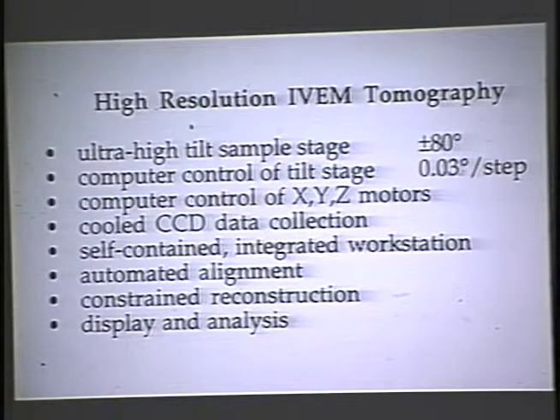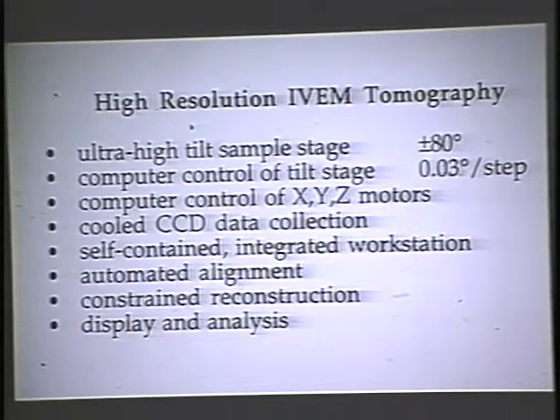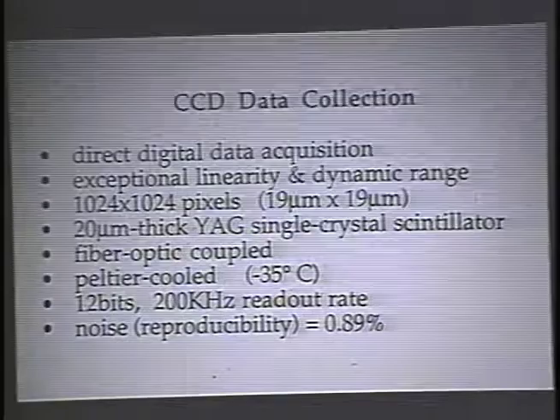The other things have to do with the computer control of the microscope in an attempt to get to the point where we can fully automate the data collection process. And then we've tried to provide the human interface, a completely self-contained and integrated workstation for actually dealing with all of this data and the digital image collection. Okay? And then there are other aspects of reconstruction that I'll go through.